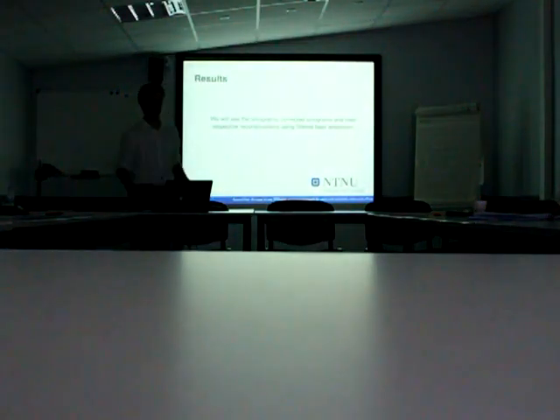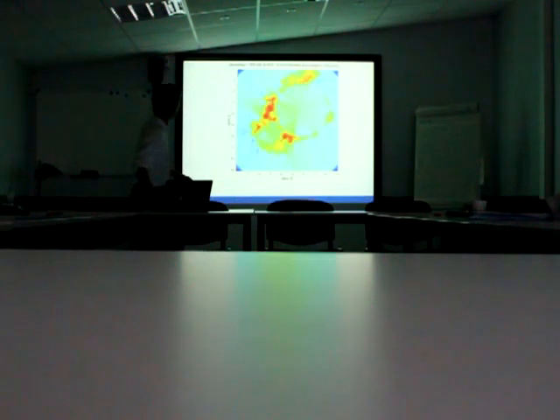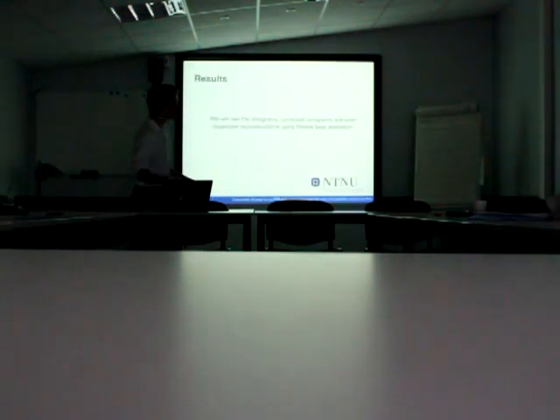So we will see some of the sinograms and the automatically corrected ones and their reconstructions, using just filtered back projection because the SART was not available on my laptop. Could you see which code you used or programmed for the filtered back projection algorithm? Yeah, that's the scikit-image library, which has these methods.